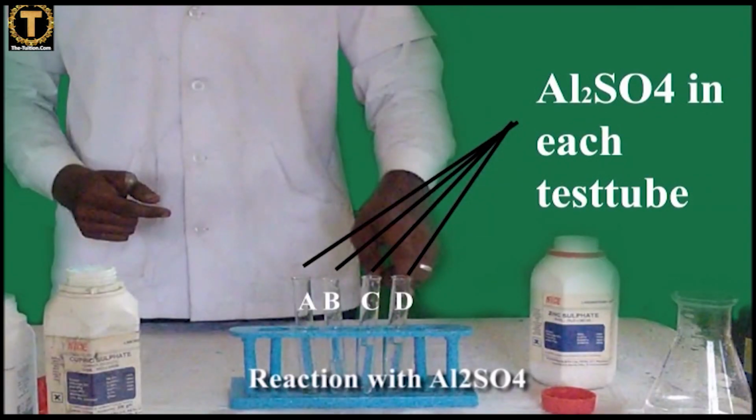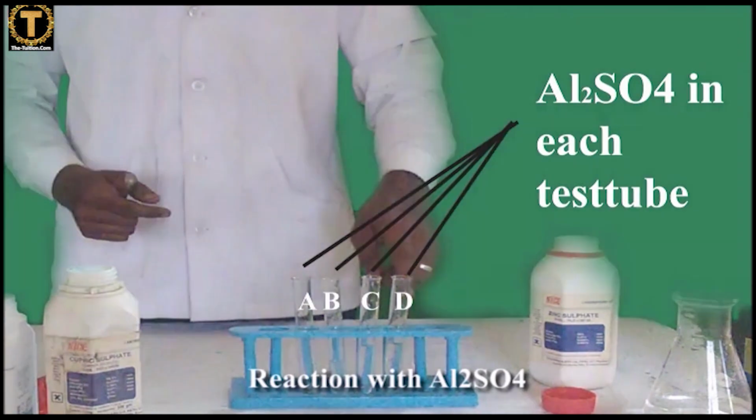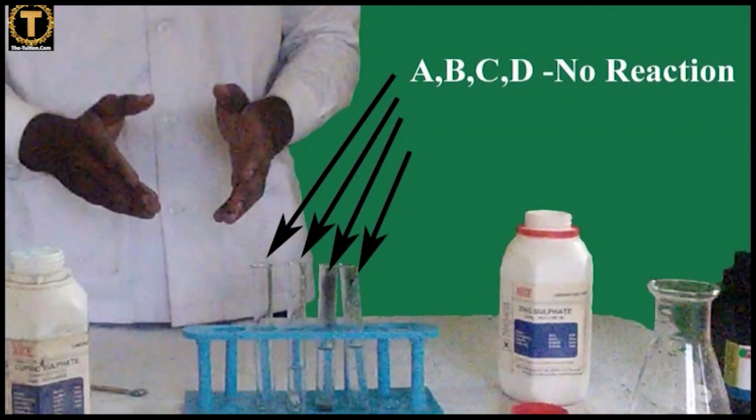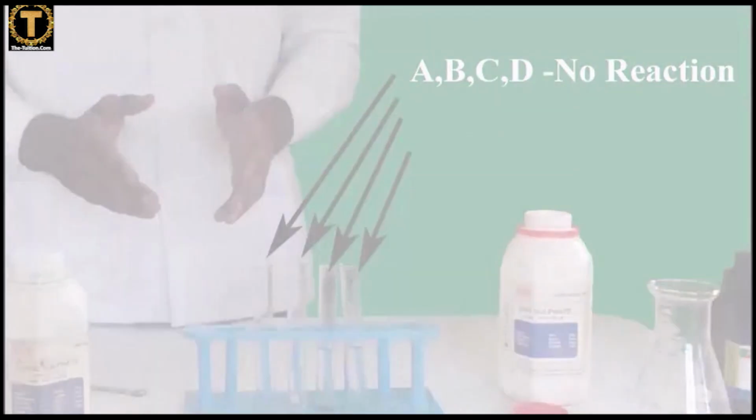Reaction with aluminium sulfate solution. Add aluminium sulfate solution in each test tube. Dip a small clean piece of aluminium, zinc, iron, and copper metal in each test tube respectively. And now the observations are: all test tubes have no reactions happening in them.